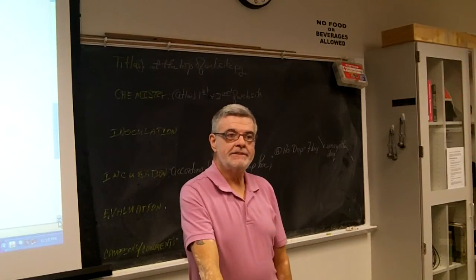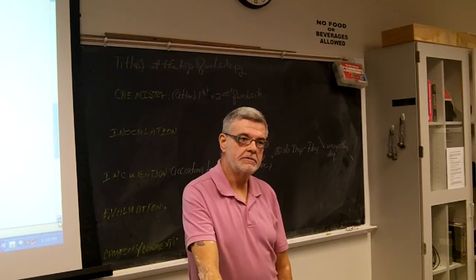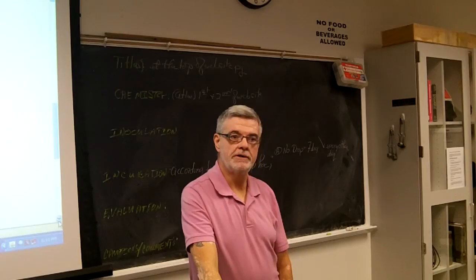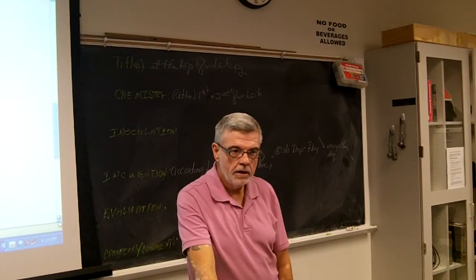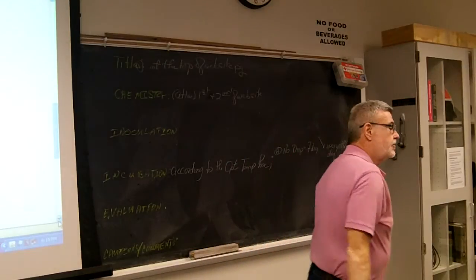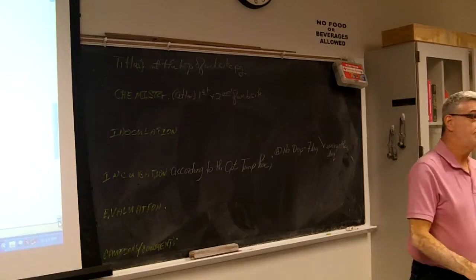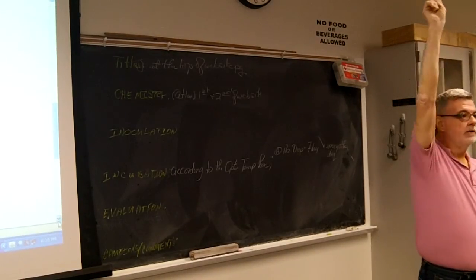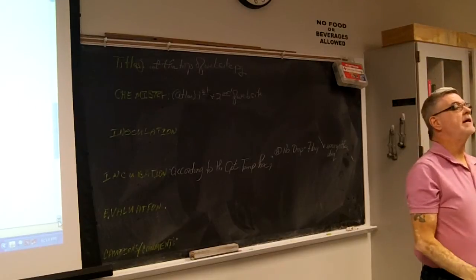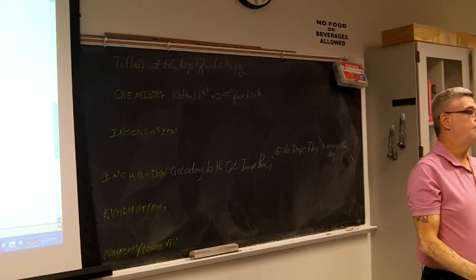Now, if it's positive, what else do you check for? Gas or not? What if it's orange still? The cupcakes aren't done. What do you do? Stick it back in. So you come back, a week from when you inoculated, the Tuesday after the Tuesday that you inoculated it, you take it out, you mix it, you hold it up against white paper. If it finally is yellow, you write slow positive. And you check for gas.